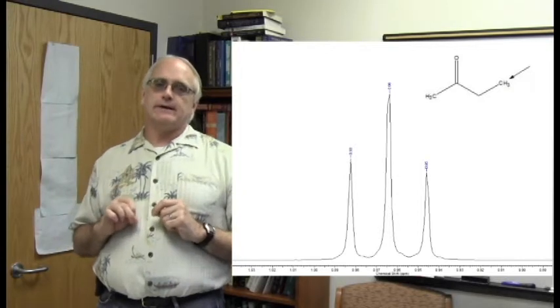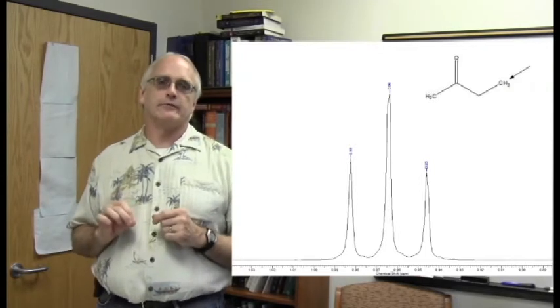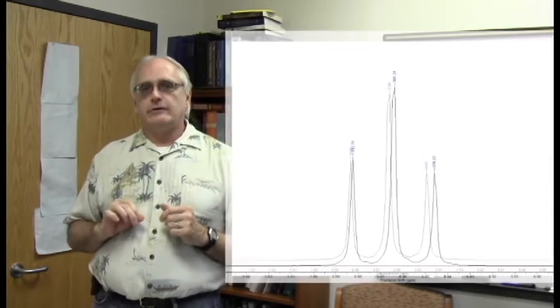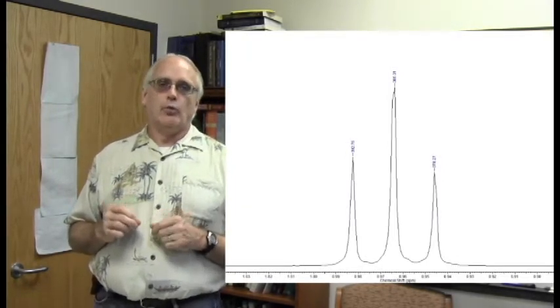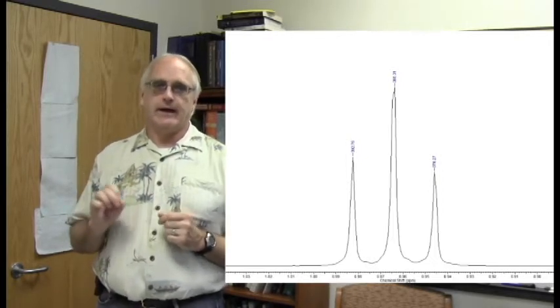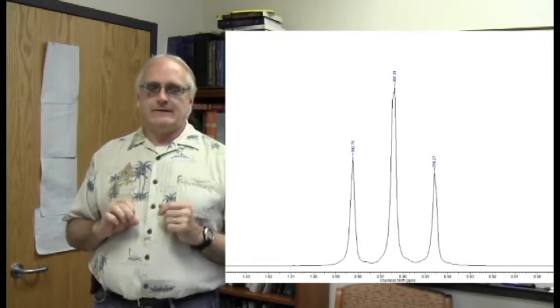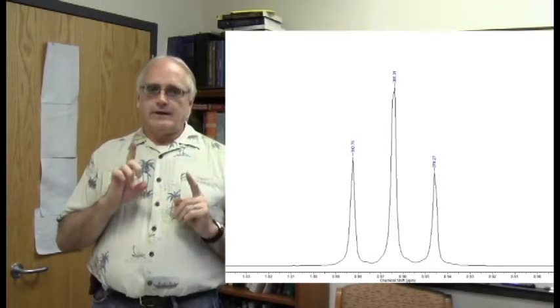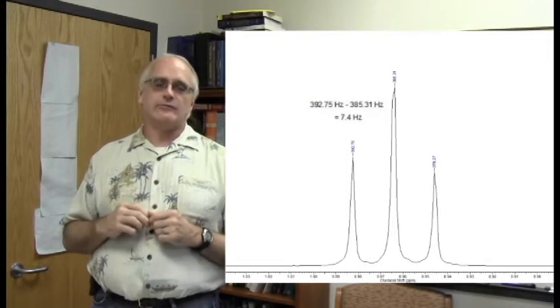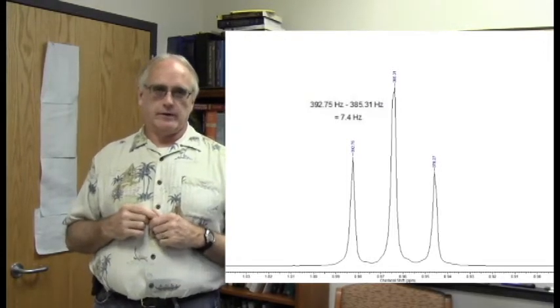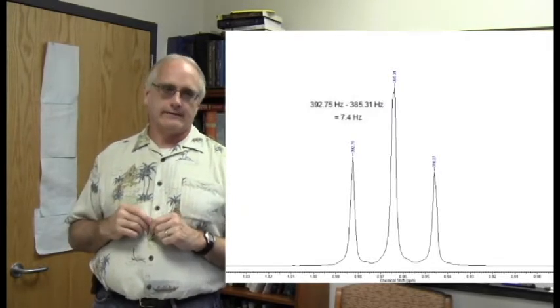Now, instead of letting the instrument label these peaks with their ppm values, 0.9 ppm or so, look at this one where I've switched it to actually labeling hertz. Now remember, on our particular instrument that we use here, 1 ppm is 400 hertz, so you notice these values are just under 400. But if you look at any two adjacent values here, if you take the value in hertz for these two peaks and subtract them, that is where the 7.2 coupling constant we measure here comes from. And the same thing happens if you go from the center peak over to the right instead of to the left.